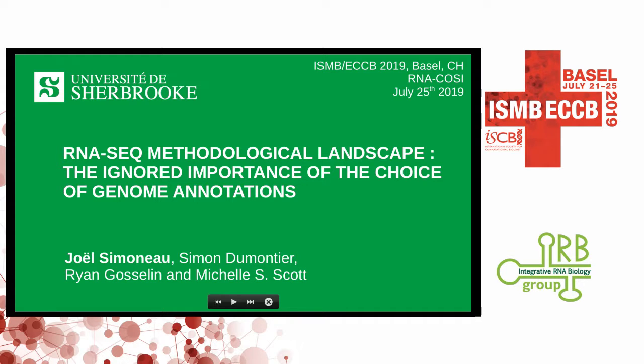RNA-seq is a quickly evolving method, and the average dataset has quite changed throughout the years. To ensure a sound processing of an RNA-seq dataset, research groups must stay ahead with the ever-updating state-of-the-art technology. By looking at what the community is doing, we might identify important actions that need to be taken to ensure that all data is rightfully treated.